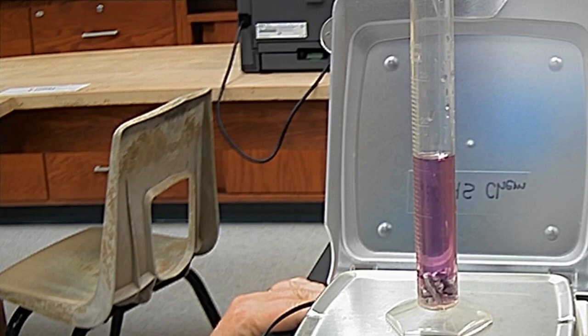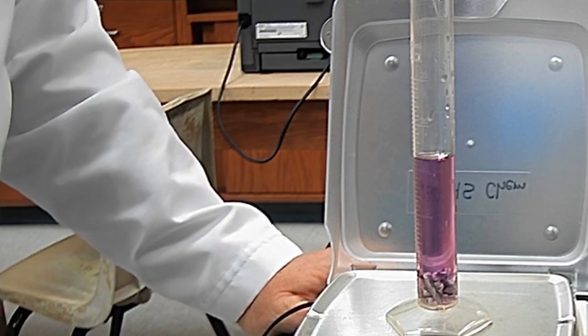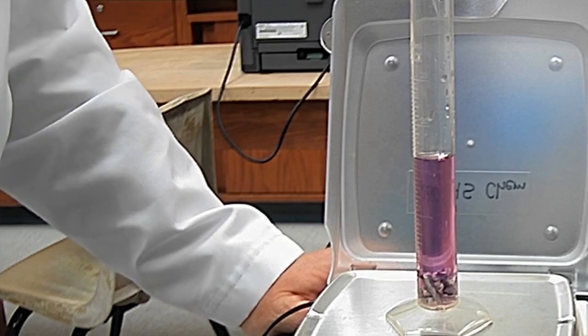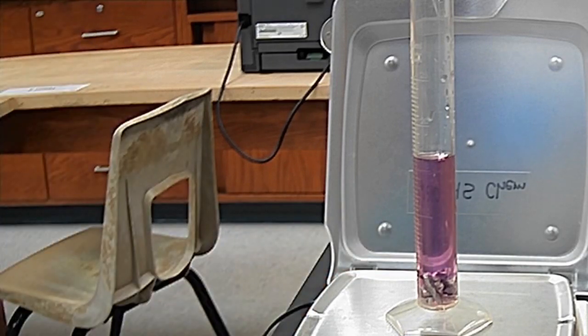Hopefully I don't hurt myself. It's going to be about 16.1 grams. So our new volume is, not grams, Mrs. V, 16.1 milliliters. So our new volume is 16.1 milliliters. So you're going to write that down, okay?